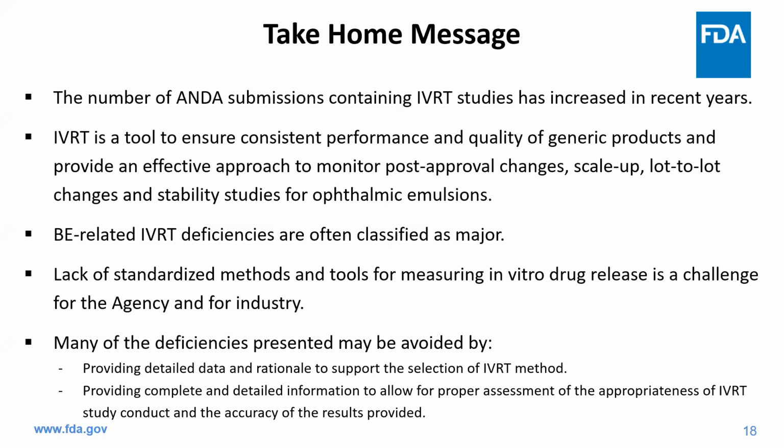The lack of standardized methods and tools for measuring in vitro drug release is a challenge for both the agency and industry. And many of these deficiencies that I have just presented may be avoided by providing detailed data and rationale to support the selection of the IVRT method, as well as providing complete and detailed information to allow for proper assessment of the appropriateness of the IVRT study conduct and the accuracy of the results provided.